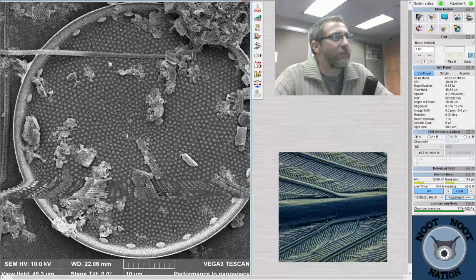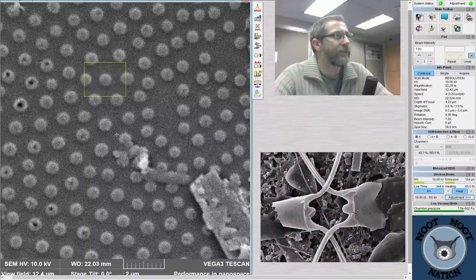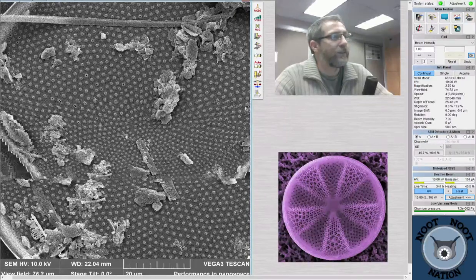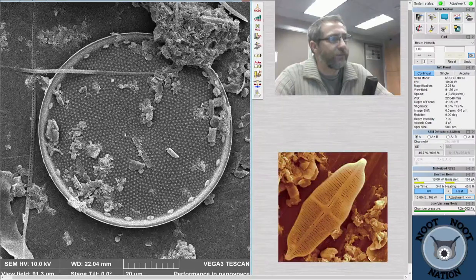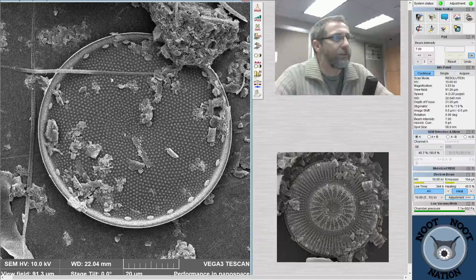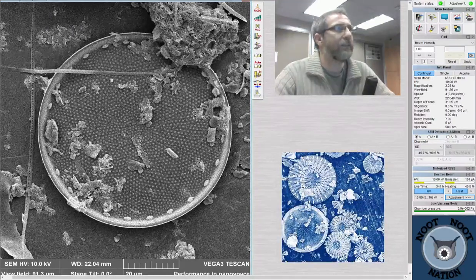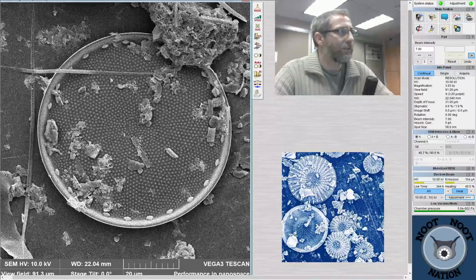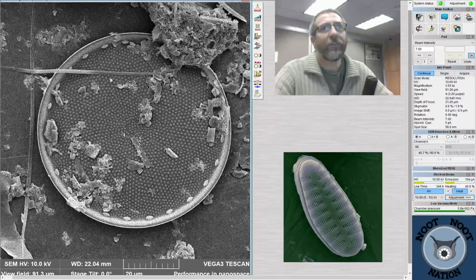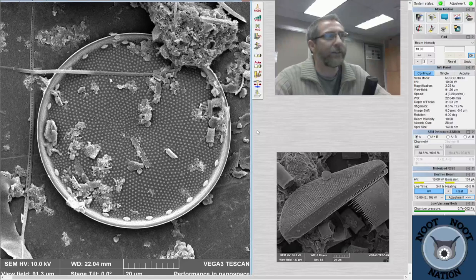So, starting right from the top, this big diatom that we have on the SEM right now is an Actinocyclus. And I can tell that even though we're still kind of far away from the sample, because the outside of the diatom has a ring of these trumpet-shaped structures that go all the way around the outside. These are rimoportulae, sometimes called labiate processes, and a ring of rimoportulae with this trumpet shape is characteristic for Actinocyclus. If we look closely, somewhere around the outside edge here should be a weird looking bump, probably under some junk, called a pseudonodulus. And the pseudonodulus is another key way of identifying that you're looking at Actinocyclus.